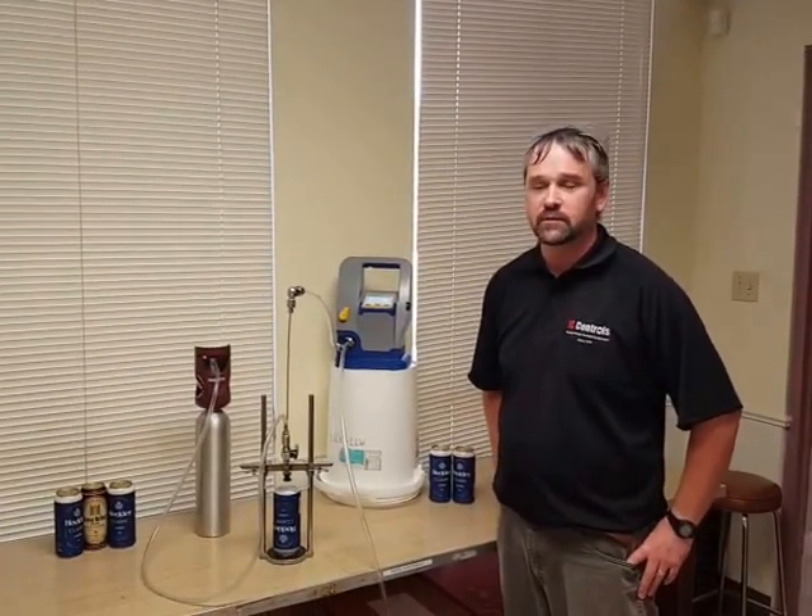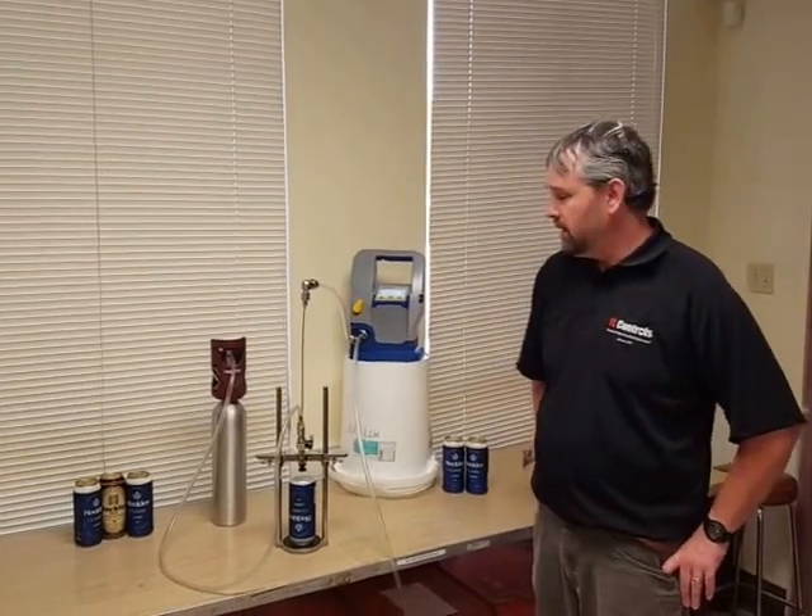This is a quick start guide for IC Control's DO rental unit that measures beer. First, I'm going to go through what comes in the unit.